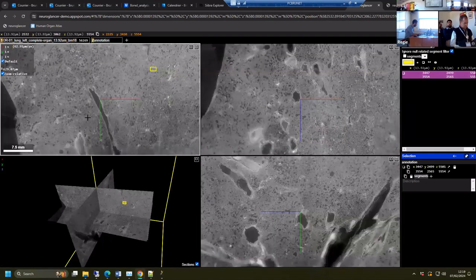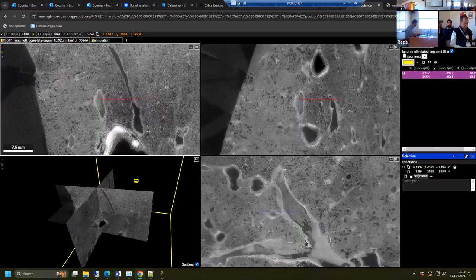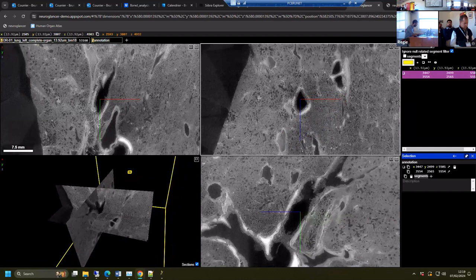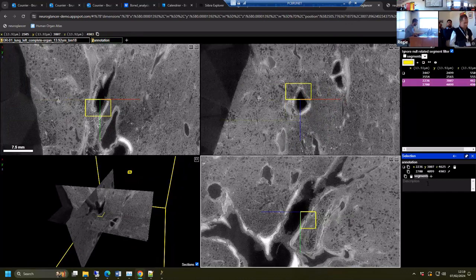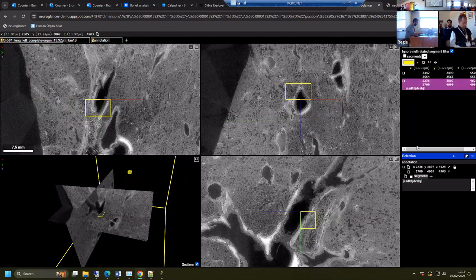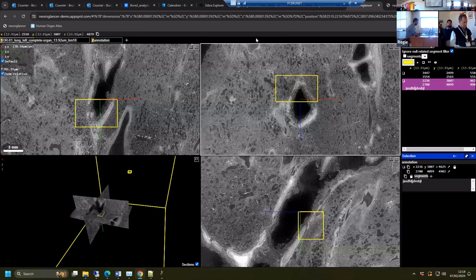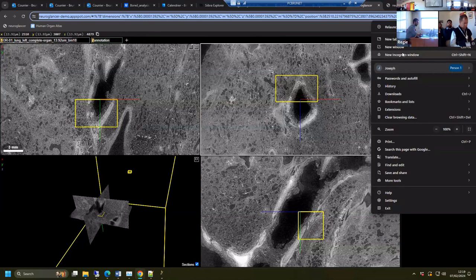So if I, let's say, this, I want to look at, no, we'll say this artery, no, this airway. We'll do this like this. So you want to select this part. You will do the annotation like this. You can do a description, like I write a bunch of nonsense. And what is cool is once you have done that, you can copy the link, send it to your collaborator.